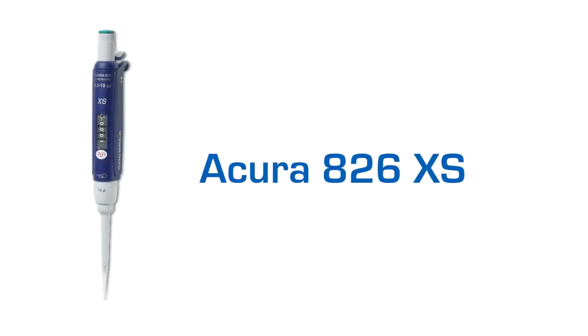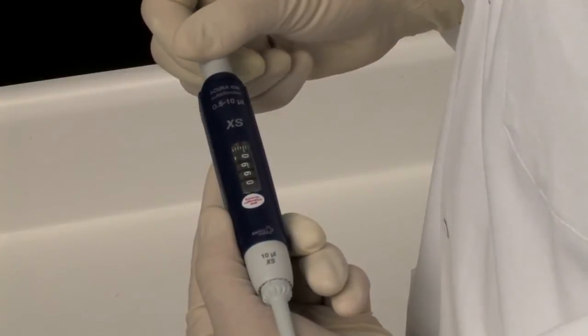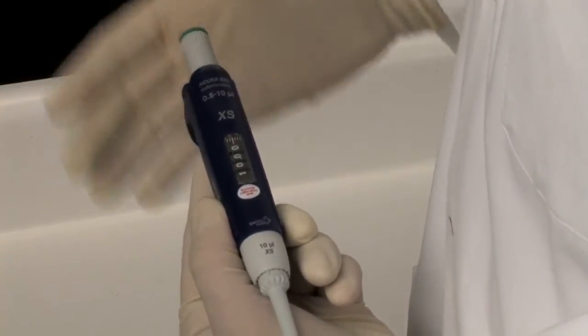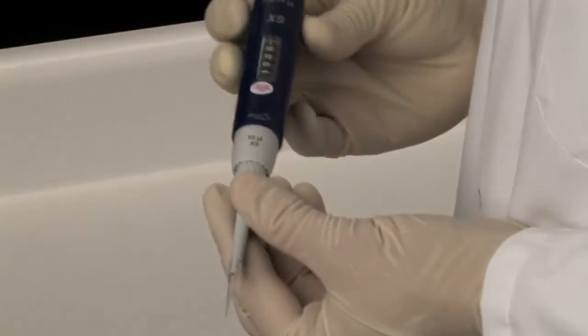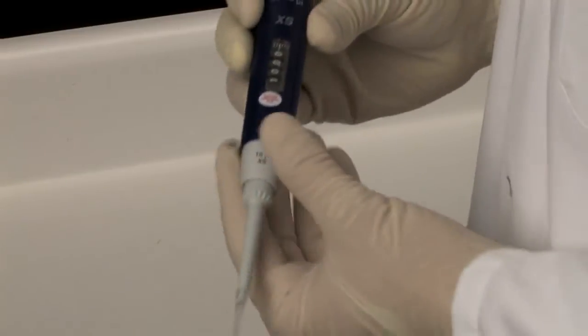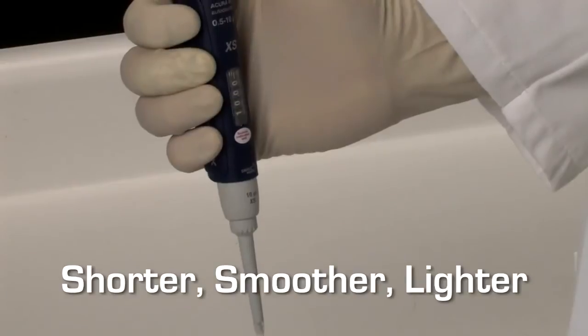The new Acura 826XS is specifically designed for research applications to make working with critical samples trouble-free and more precise. While providing all of the standard features of the Acura Manual line of pipettes, including precise setting and checking volumes, as well as user-friendly tip adjustment to accommodate a variety of tips, the 826XS is shorter, smoother, and lighter.